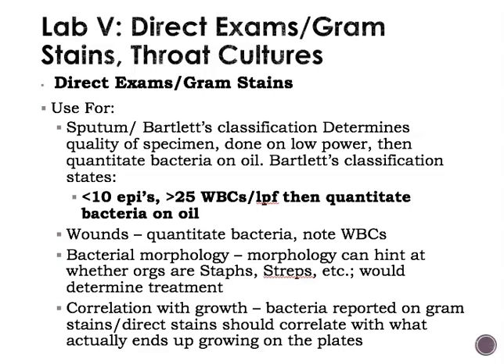It helps direct treatment for the physician because we can get that direct smear or gram stain result out 12 to 16 hours earlier than the actual culture preliminary results will come out. So if the doctor is seeing an indication from our gram stain result that indicates a certain particular bacterium, then they can go ahead and start treatment. So correlation with growth. You can think of it as a means of QC, because if we don't grow out on the plates what we report from the direct exam or the gram stain, then something's wrong. We need to maybe investigate that.